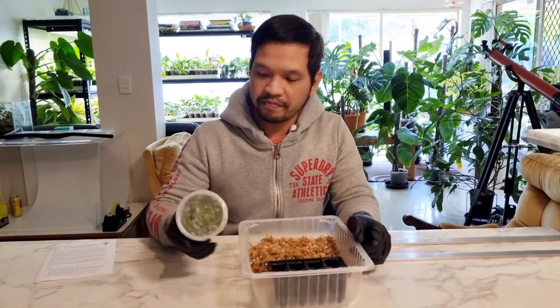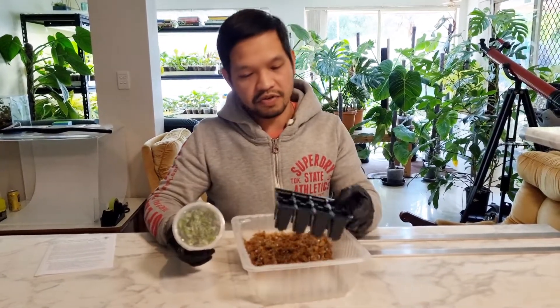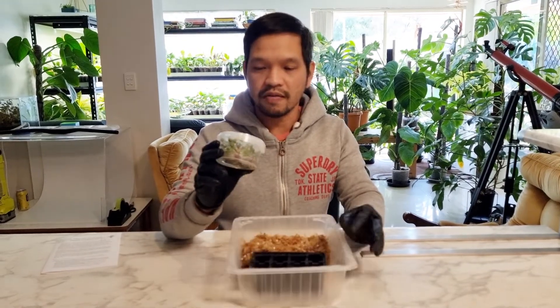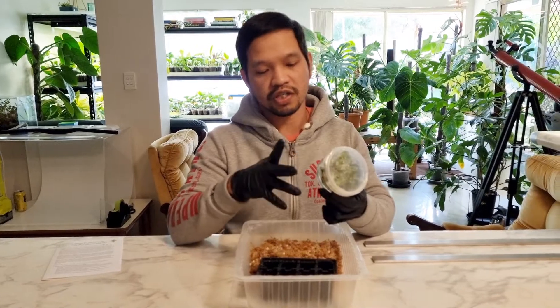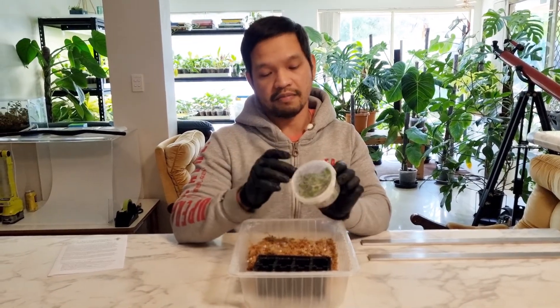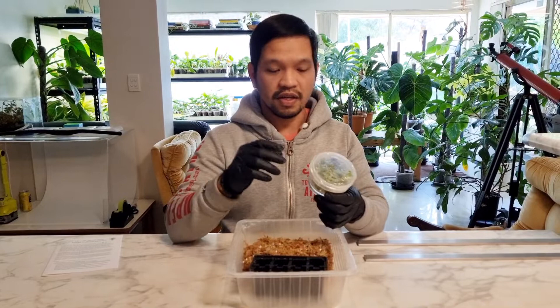Here the tissue culture plantlets still inside the flask, sealed, and we have the tray in here and the media that we use. The first step will be removing these plantlets out, then washing off the flask, washing these plantlets with running water, drying them off a little bit, and then planting them on the media.